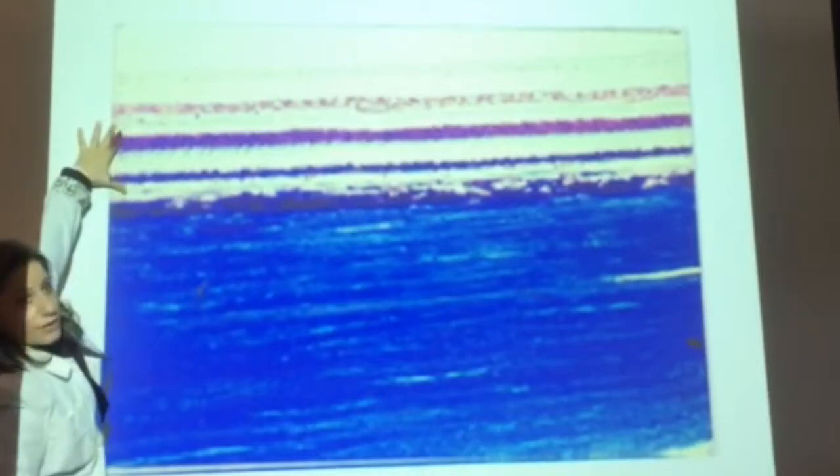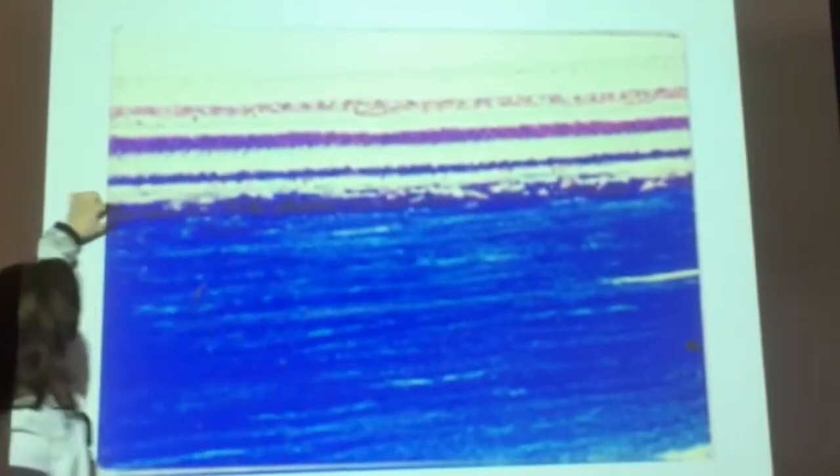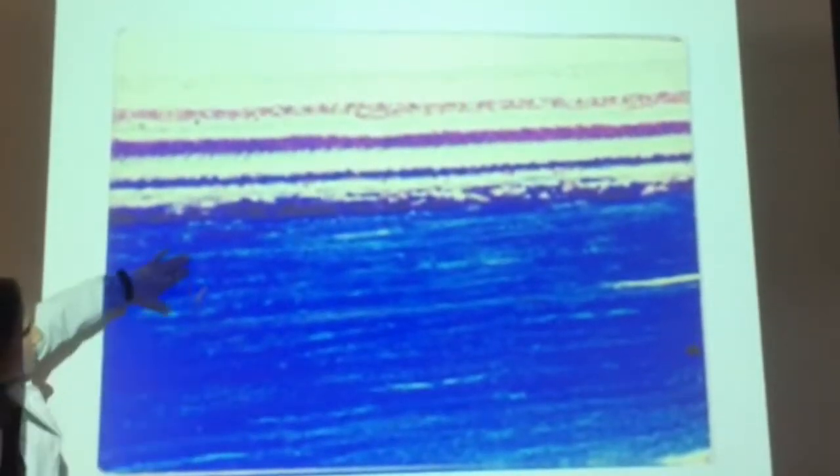Again, this is going to be rocks again. So remember that this is the retina. The retina is over here with its several layers of peanut butter and jelly. Then you have the choroid right here. And then this is your sclera. Of course, it's white, but they did it in blue just so that you could actually see it better. So remember R, C, S.